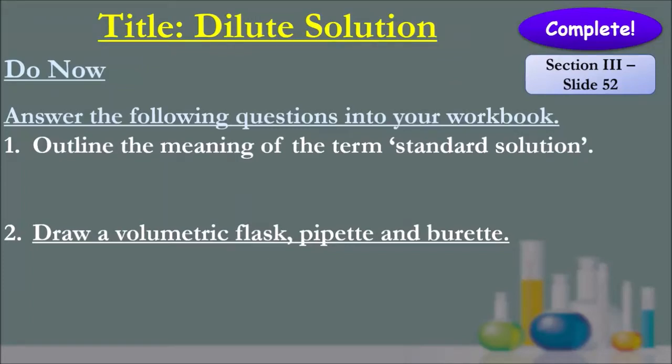We are back in chemistry and we are talking about dilute solutions today. What you might have come across yesterday when we talked about trying to prepare a standard solution where you have a known mass, we're going to cover that again just as a recap today in case you might have forgotten. But we are also going to look into concepts of what is a dilution and how do we make a dilute solution.